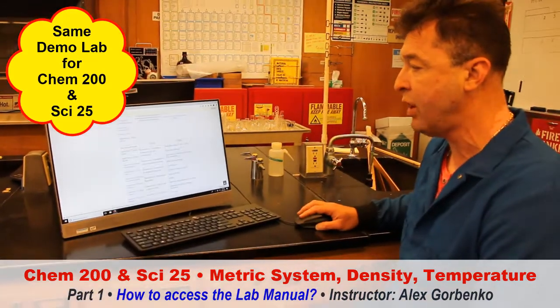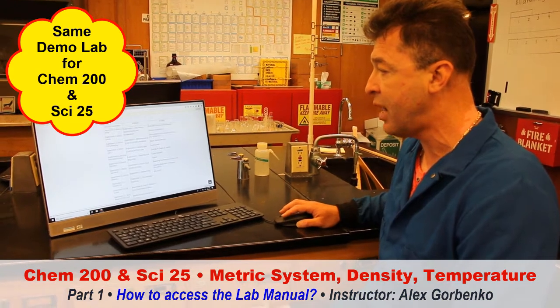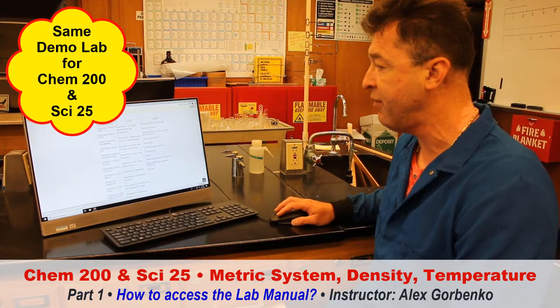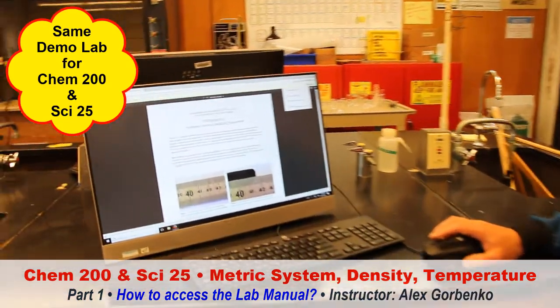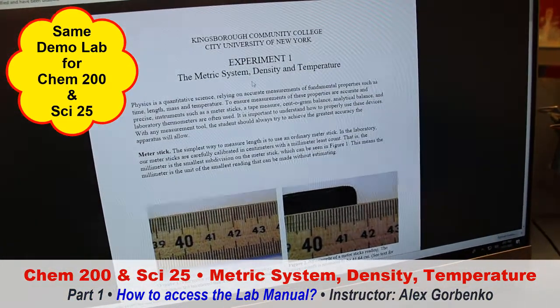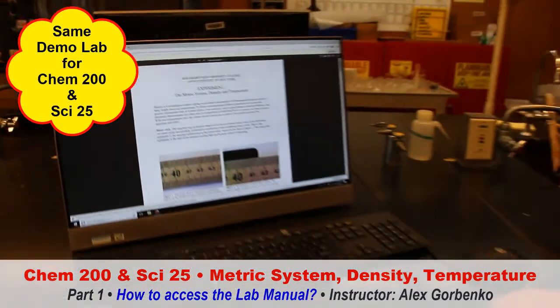Of course, we are talking about Science 25 here, and you're going to scroll down and see all of the manuals for the Science 25 course. So I'm going to click on this manual, and here we have the PDF file of this experiment. The first experiment, number 1, will be the metric system, density and temperature.